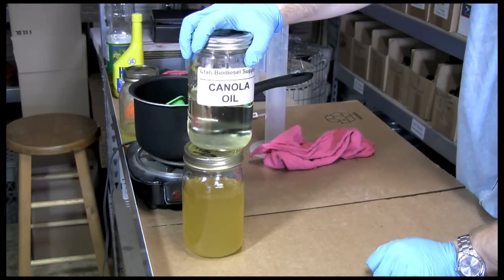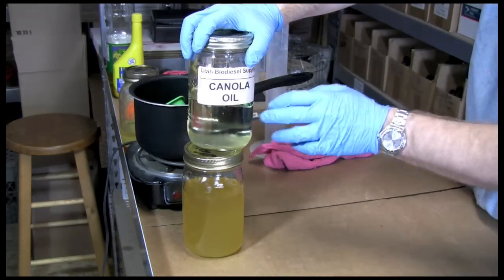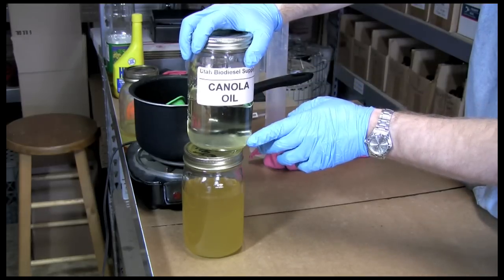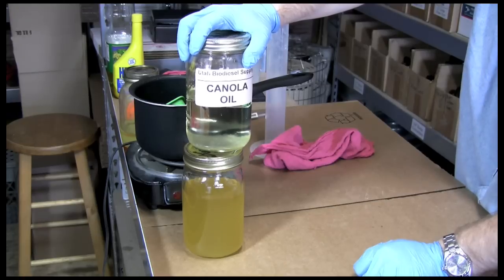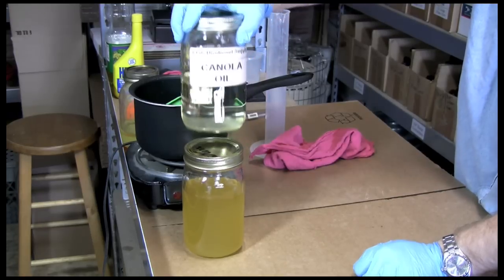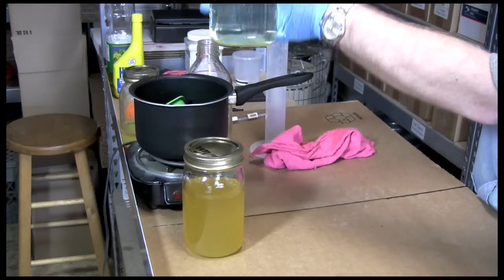After you remove the glycerin from your biodiesel, you'll have biodiesel on top. As you let it sit for a couple of days, it will begin to become crystal clear. This is biodiesel again that we made from canola oil a while ago, and as you can see, you can see right through it.